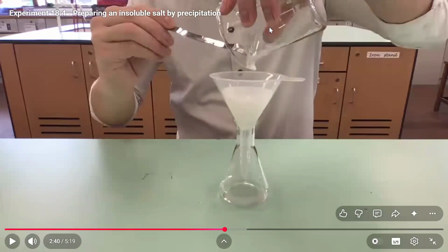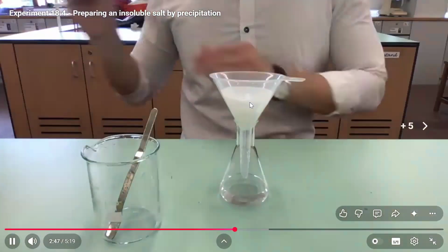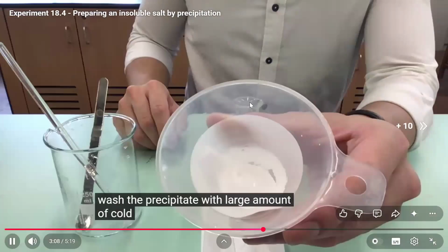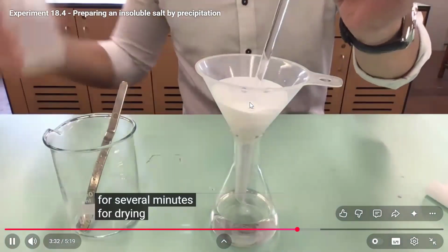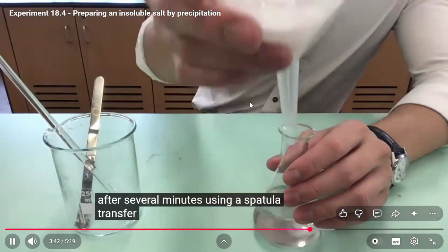So you're going to add some water and transfer the washings from there, ठीक है। And also you need to rinse, okay, like you have to wash with distilled water. Now they're just washing with cold distilled water. Leave the precipitate to stand for several minutes for drying. अच्छा, अब cold distilled water इसमें इसलिए कह रहे हैं बच्चों, because के soluble ना हो जाए precipitate, ठीक है। Spatula. Transfer the precipitate.